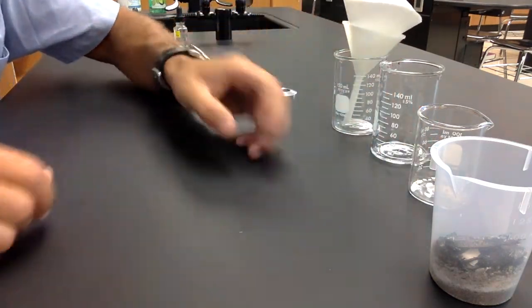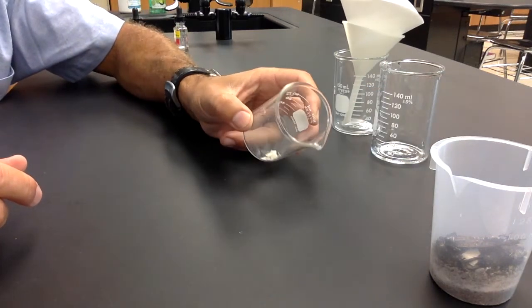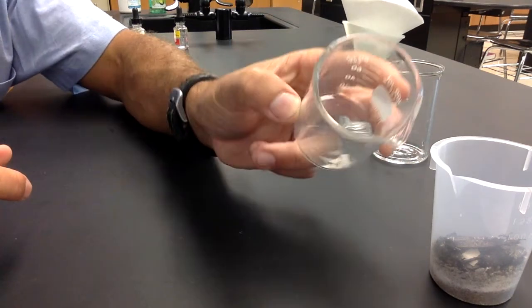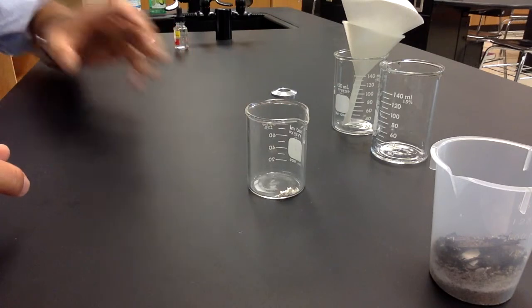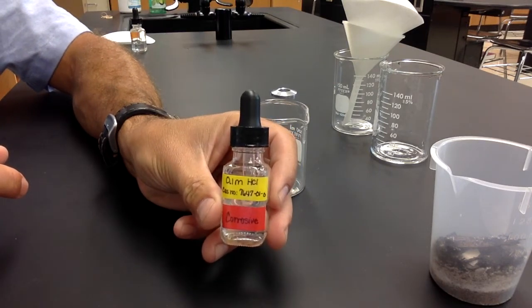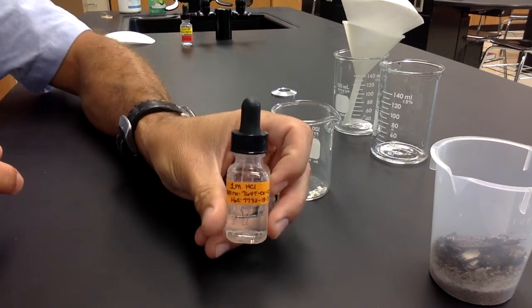Another thing you're going to need to realize is you have to separate the seashells from the sand, which is very difficult because the seashells can actually be quite powdery. So what you would need to do is react it with hydrochloric acid. You will use the 1 molar hydrochloric acid, which is going to be this one, more concentrated.